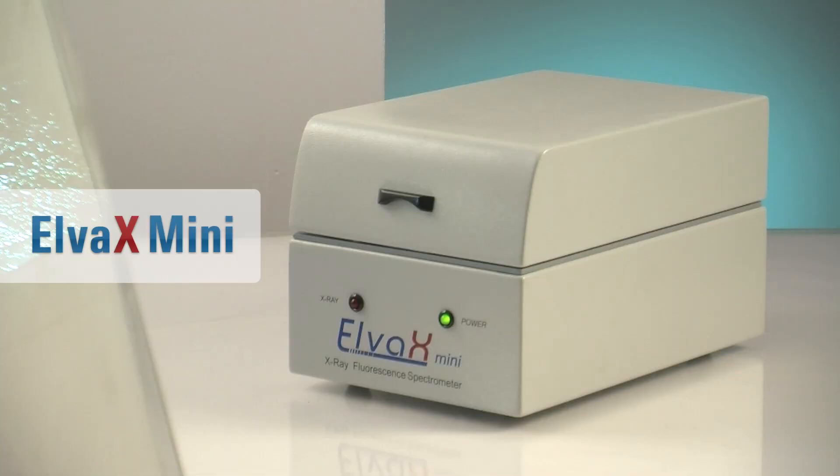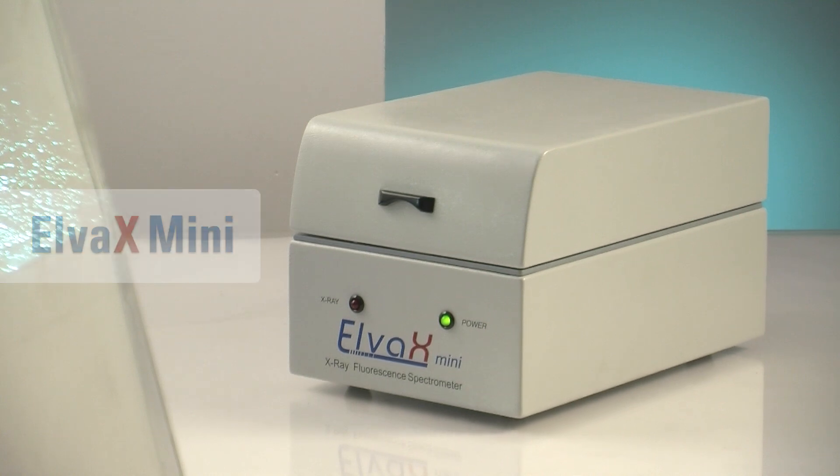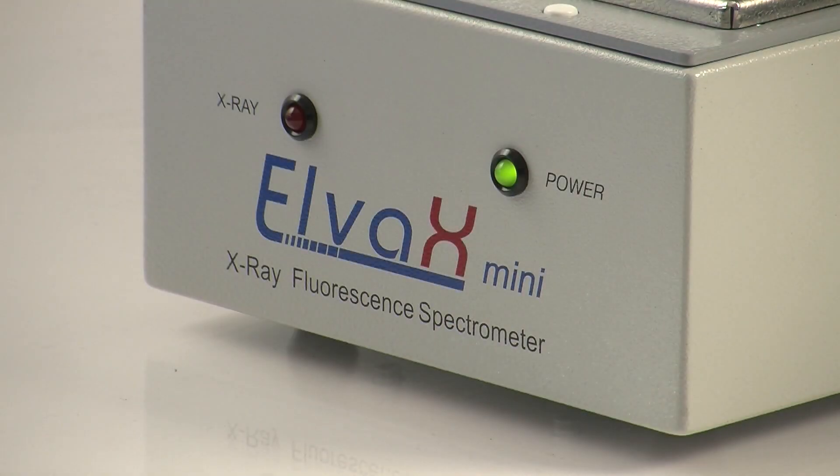Elva X-Mini is an acknowledged expert in precious metals analysis. It's a compact benchtop spectrometer designed to determine the elemental composition of precious alloys with superior accuracy.